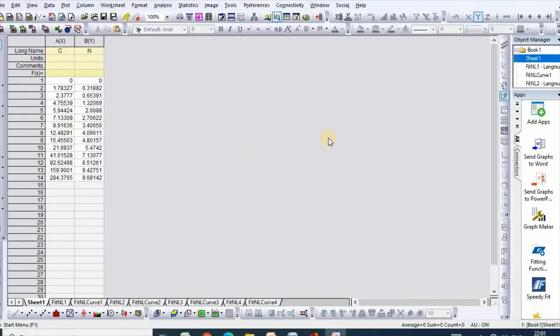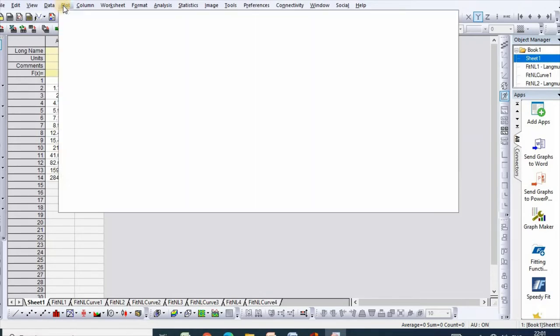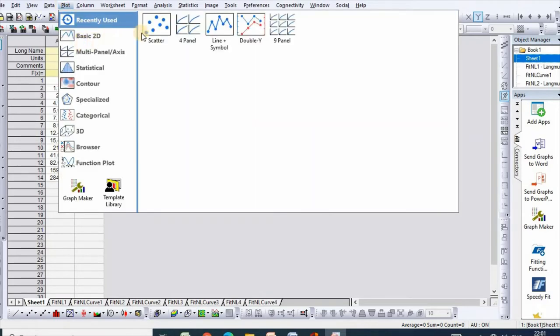In order to plot Temkin isotherm, I have taken my data from Origin sheet to Excel. Now click Plot and select scatter.